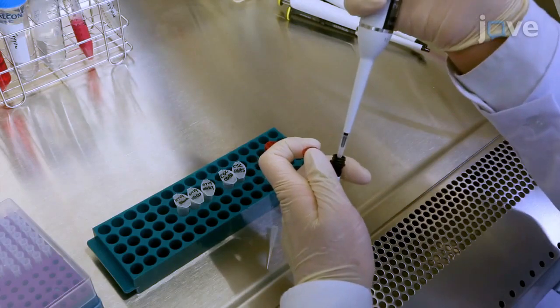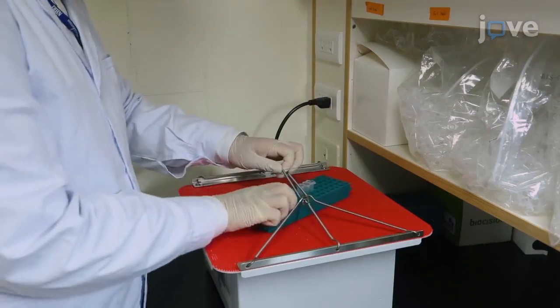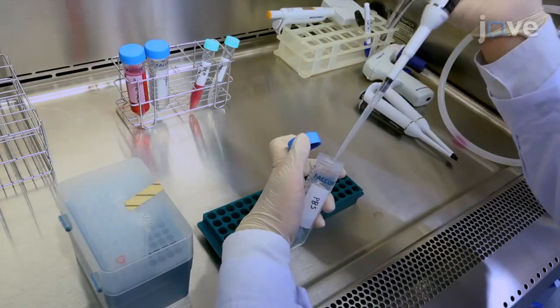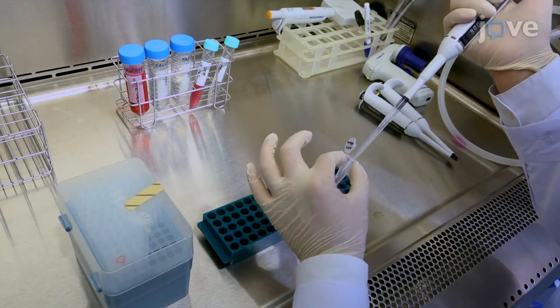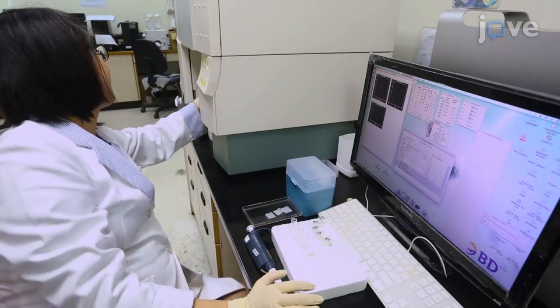Add 2 microliters of the primary antibody of interest to each tube and incubate the cells for 30 minutes at room temperature and 200 revolutions per minute. At the end of the incubation, wash each tube with 900 microliters of PBS and analyze the cells for expression of the protein of interest by flow cytometry, according to standard protocols.